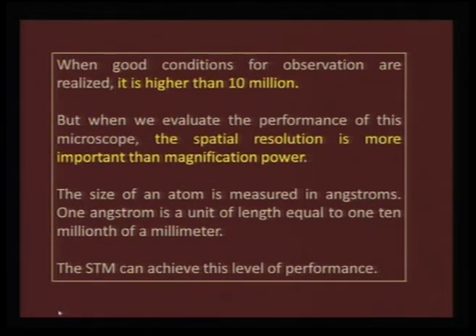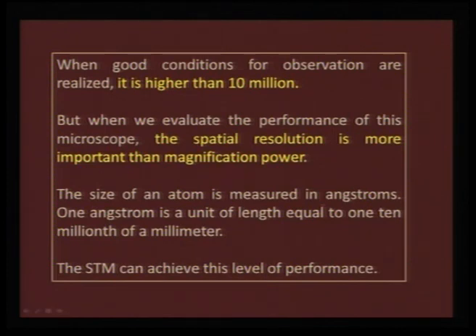And what we also look at here is spatial resolution, which is far more important than magnification power, because when we talk about the optical microscope or scanning electron microscope, we usually look at the magnification, but here we are looking at spatial resolution. Therefore, this is an entirely different notion in the microscopic techniques. The size of an atom is measured in angstrom, and 1 angstrom is a unit of length equal to 1/10 of a millionth of a millimeter. So, we are going to look at the material in angstrom dimension, and this can be achieved by STM.